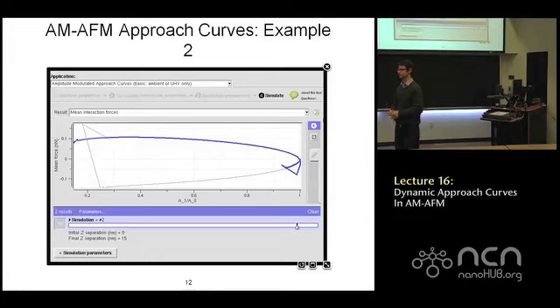There are some transients involved in between. So be careful with your mouse over tool when you look at these. If you want to know if it's a legitimate segment of the curve or just a stray point, you'll be able to see if it's a single point or a whole family of points. Probably we're going to change this to plot single points instead of connected points to make that more apparent, but for the time being, that's the case.